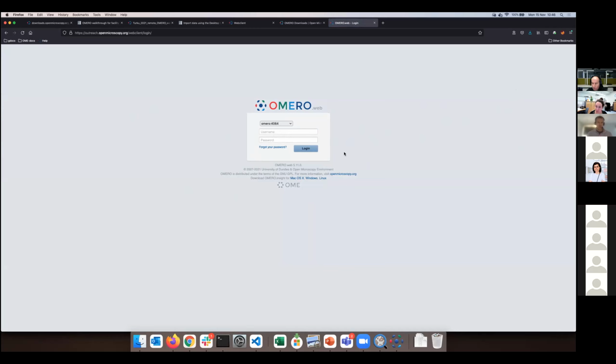Okay, so if there are no questions on this particular topic, we will go into Omero Web. Why do we go to Omero Web? Because Omero Web is our main client. Why is it our main client? Because we invest the most of our time and effort into that client, and it's the most modern of those clients which we have in Omero. And yeah, we can support only what we can.